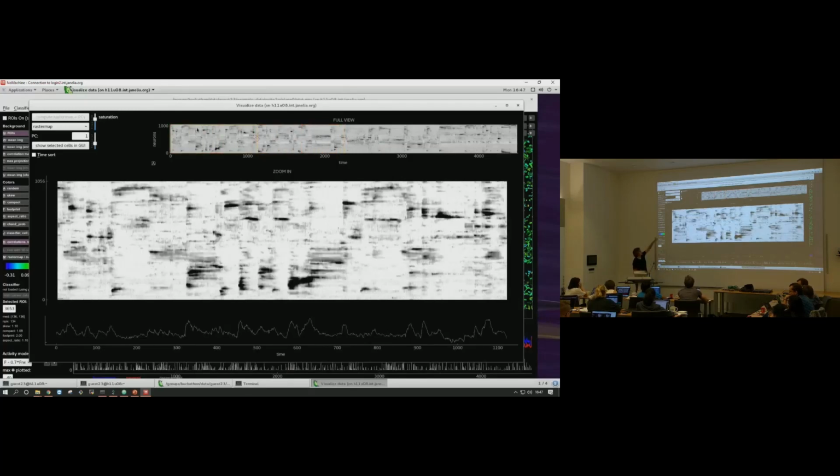So I pressed that button up at the top left, and it ran it. And so this is now the exact same data. All I did is I changed the order of the neurons along the y-axis. That's all I did. And I did a little bit of smoothing in the y-axis too, which is not so important for 1,000 neurons, but maybe more so for like 10,000.